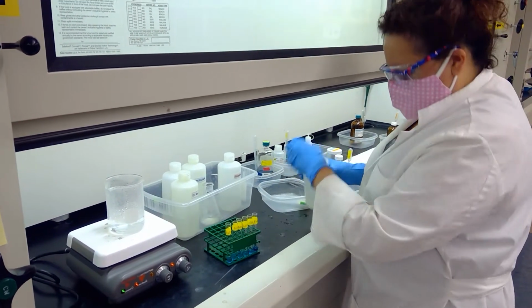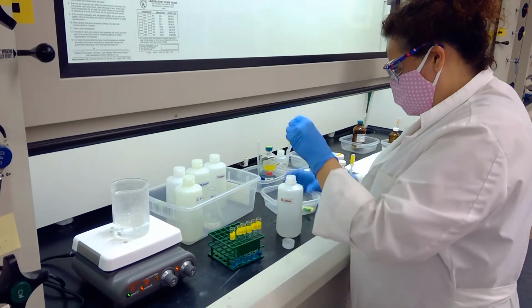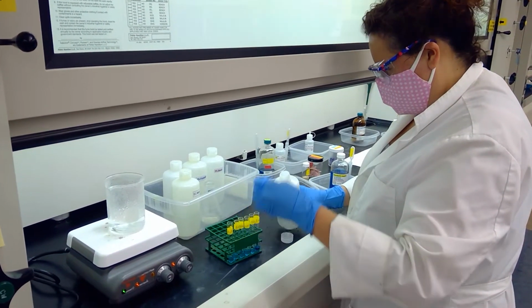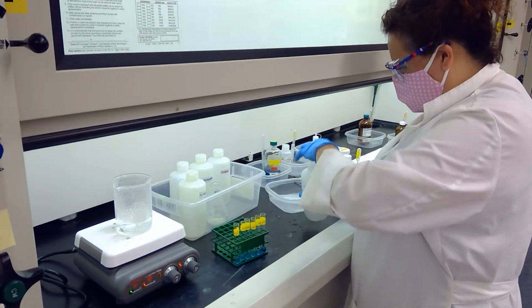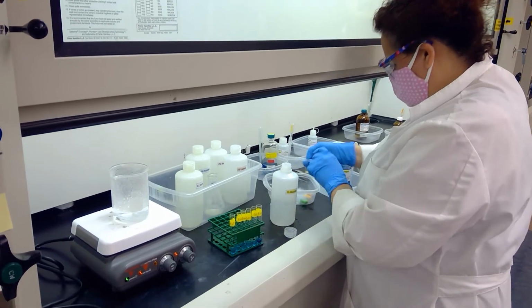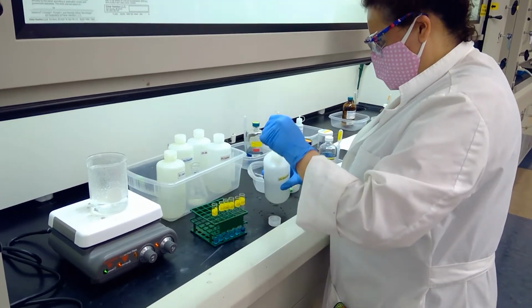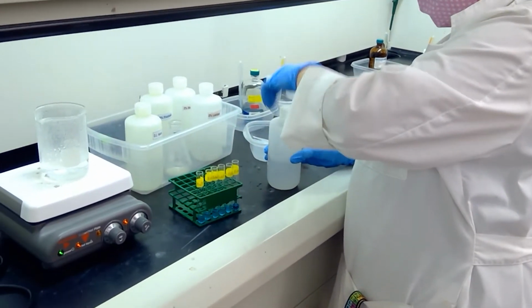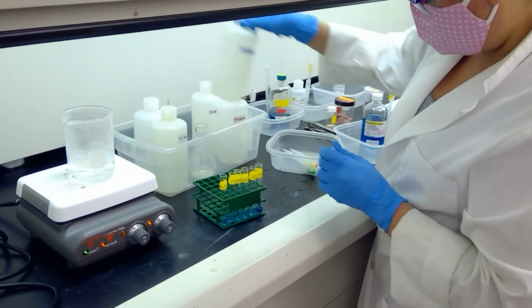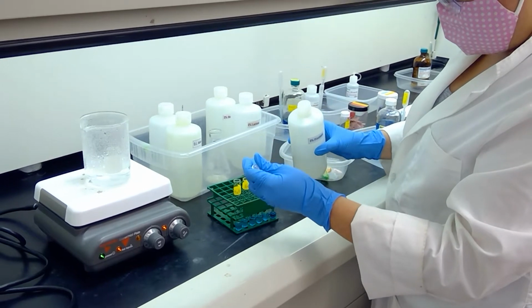Alright. Our next sample is lactose. Alright. Next up we'll have glucose. Okay, and lastly we will have fructose. So for the Benedict's test, this will tell us whether or not our sugar is a reducing sugar, and that is some important information that you will want to collect.